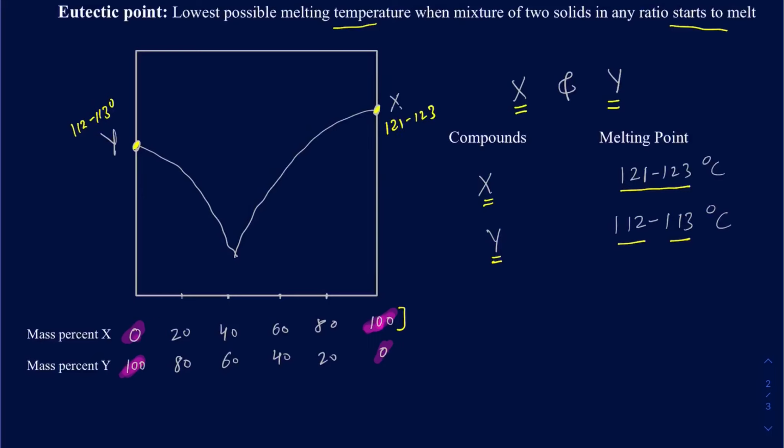In between, where you have the mixture, your melting point is going to be different. It's going to have a broad range, and it's going to be actually lower. I just made this graph. When you do the experiment in the lab, it may not necessarily follow the same range, but for example purposes, I have said this is what it kind of follows.